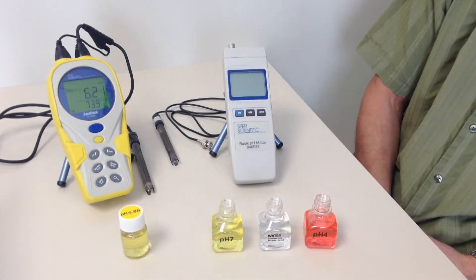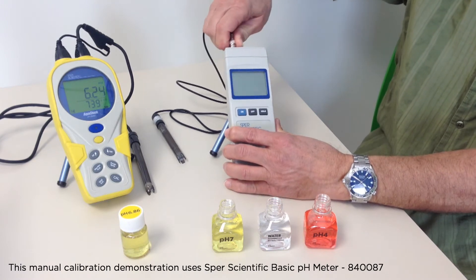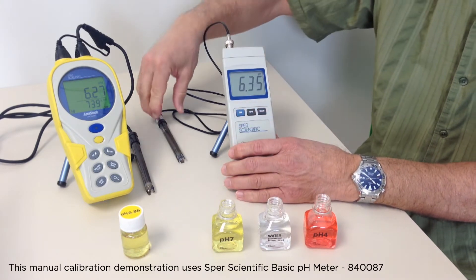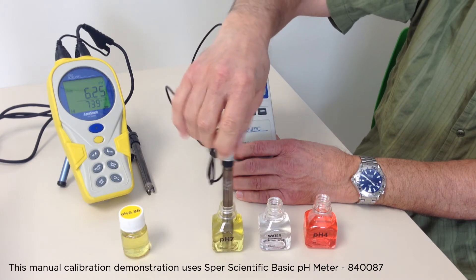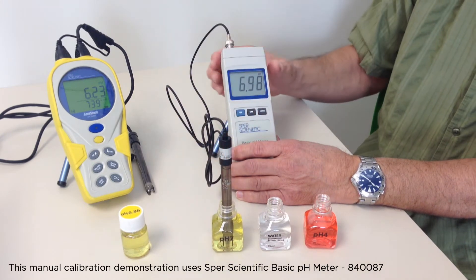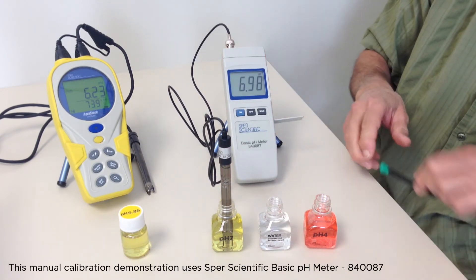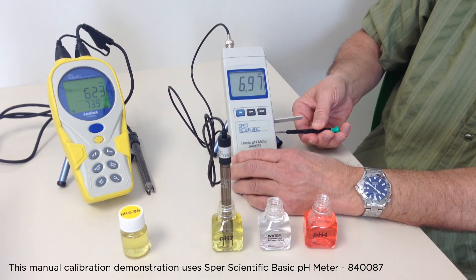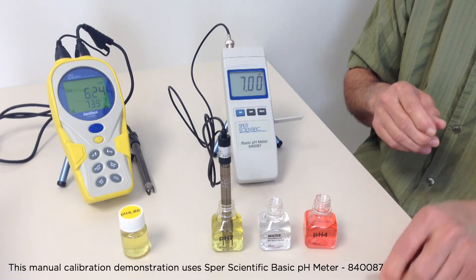Let's begin with a manual calibration pH meter. First, I put the BNC connector on the meter, turn the meter on, and put the probe in our standard solution of pH 7. As you can see, the meter is reading close but not exactly 7. To make it read 7, all I need to do is adjust this screw until it reads exactly 7.